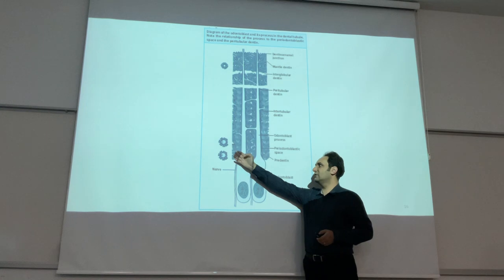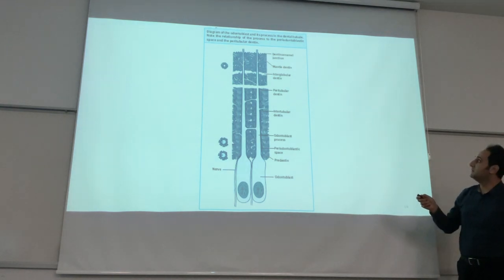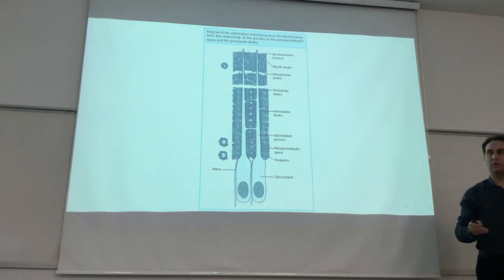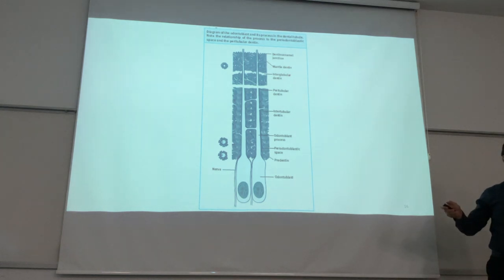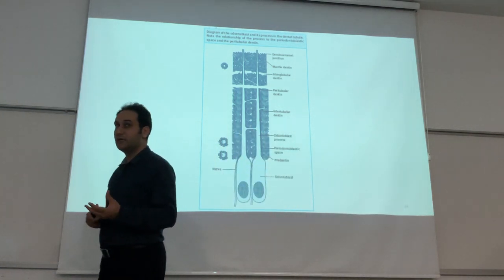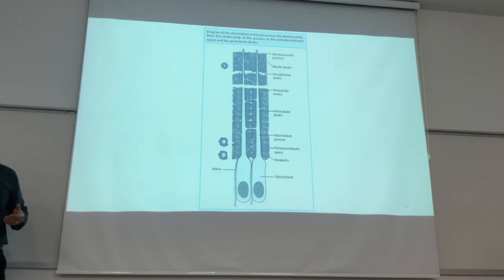And in the outer side, you can see the dentin. And also in the uppermost side, we have the dentin. This dentin present in the farthest part is our mantle dentin, first formed dentin with a low amount of channels and a low amount of odontoblastic process. This part is our interglobular dentin. This interglobular dentin appears because of a low amount of mineralization. When in some areas we have lower mineralization than normal, you can see these spaces between the dentin structure, known as the interglobular dentin.